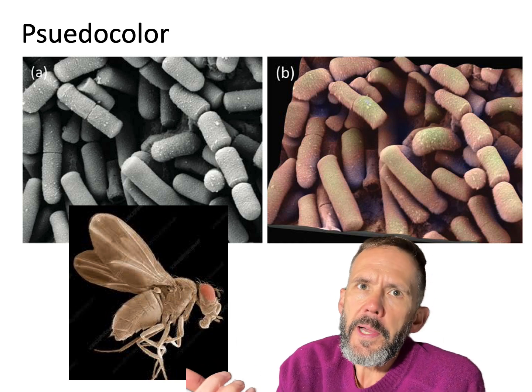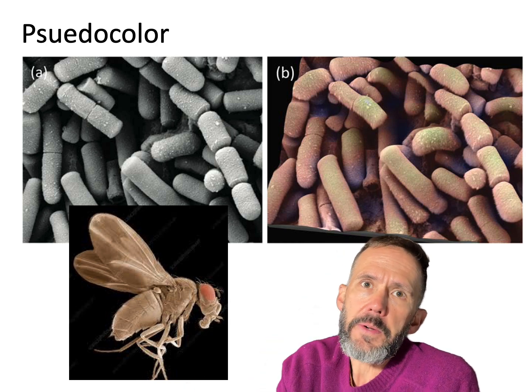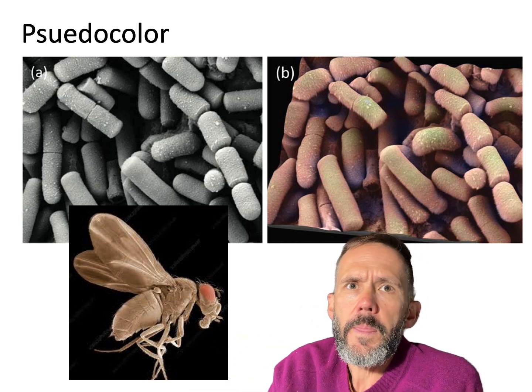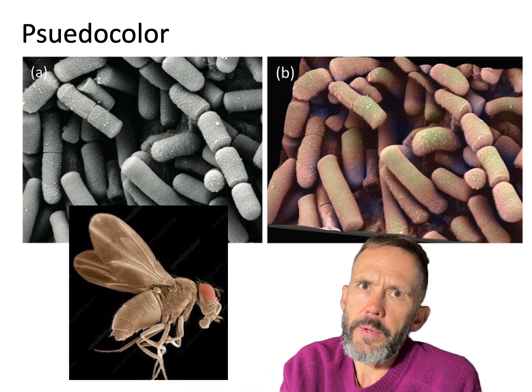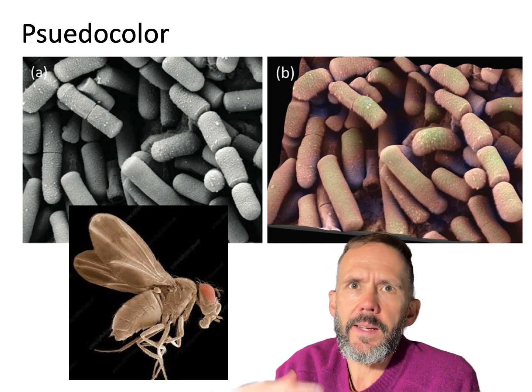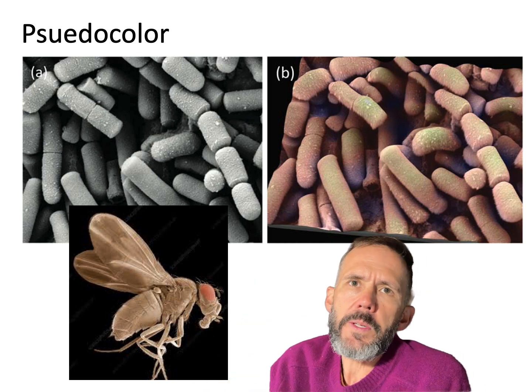One of them has been pseudo-colored, and that's not that uncommon, where you see these scanning electron microscope images, which are always very visually appealing, you know, the bizarreness of insects shown and so forth. But they're naturally only variations in signal, so they're naturally only grayscale, white to black. If you ever see any colors, which sometimes people take the artistic license or liberties to do, like on magazine covers and things, those have been pseudo-colored.